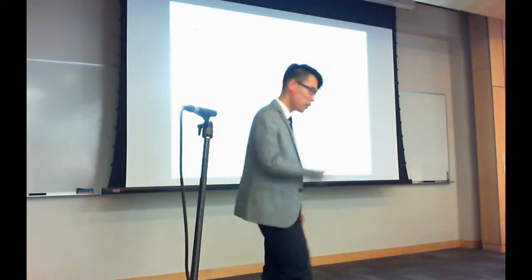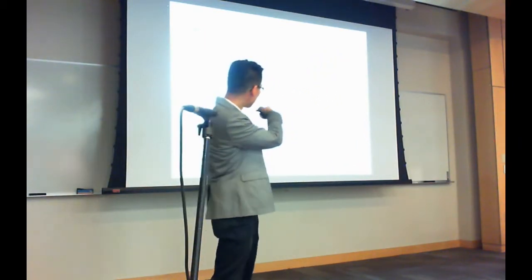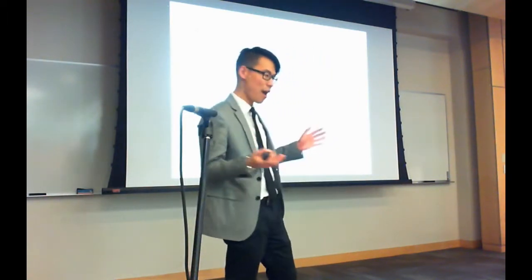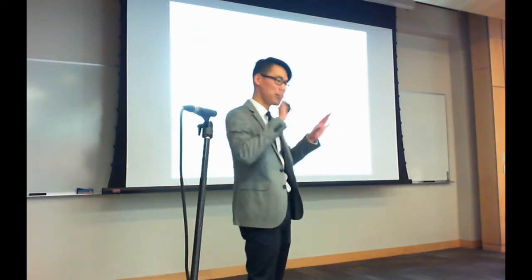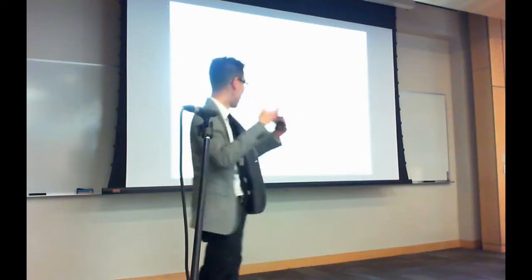We can break this down a little bit. This term in the middle, the probability of the spectrum given a score t: imagine you have a particular peptide and a particular spectrum, and they have some score t. They match by whatever algorithm you're using.